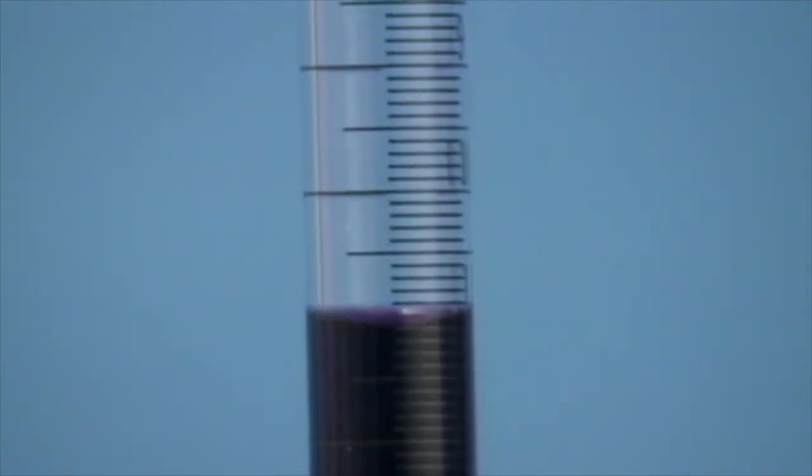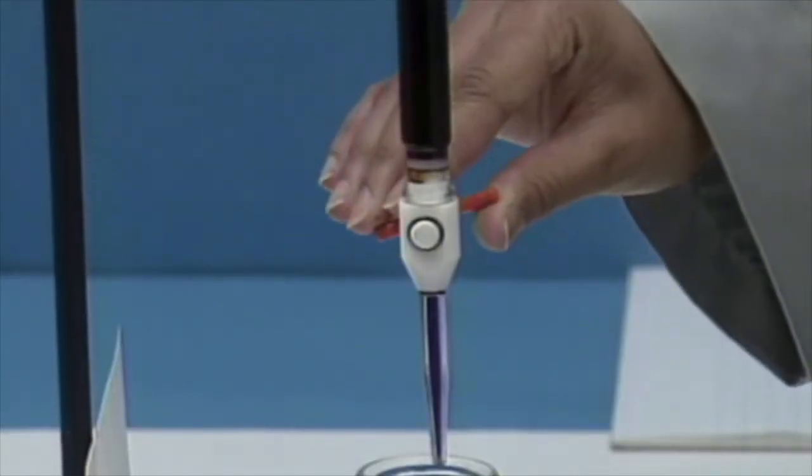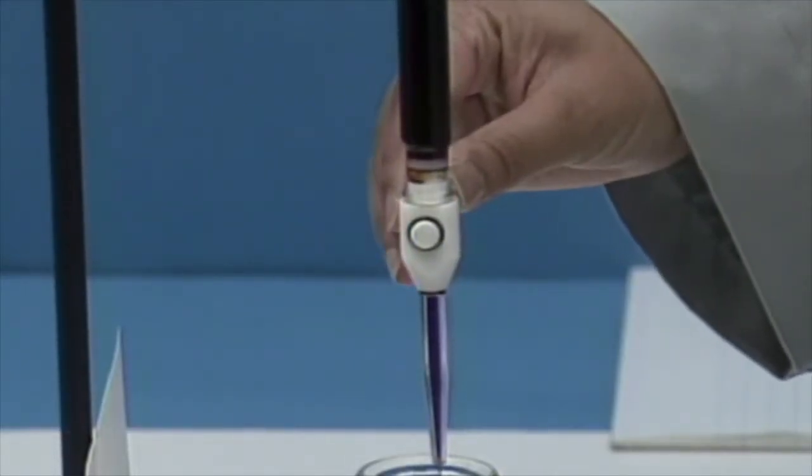The titrant is a purple solution. The titrant solution in the burette is added to the sample solution in the flask.